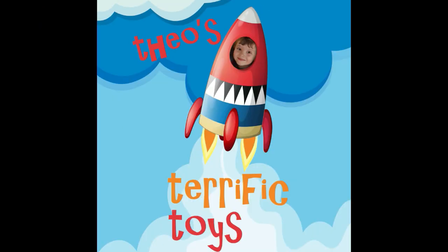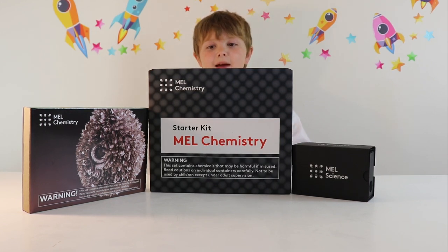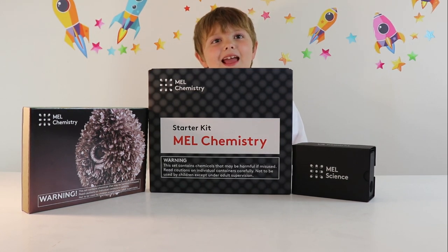Here's Terrific Toys! So guys, today we have got the Mel Chemistry Starter Kit — oh wow!